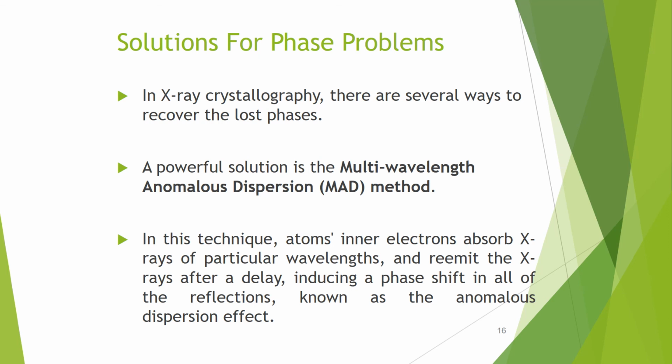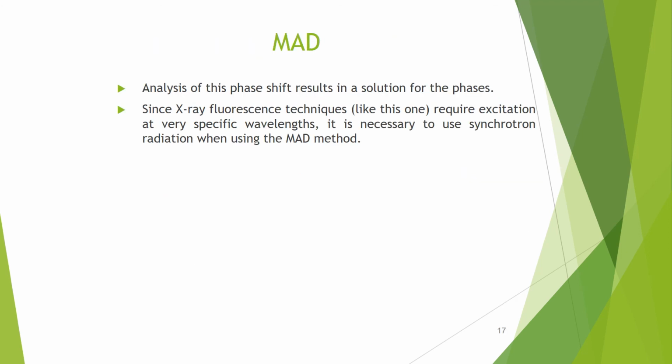In this technique, atoms' inner electrons absorb X-rays of a particular wavelength and re-emit the X-rays after a delay, inducing a phase shift in all the reflections, known as the anomalous dispersion effect. What is MAD?